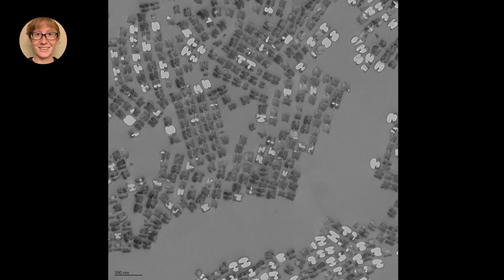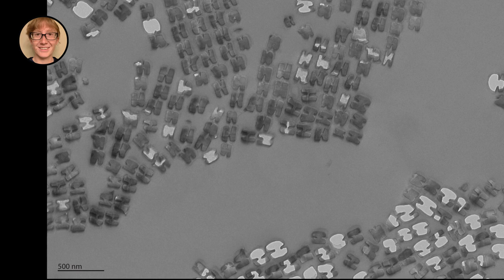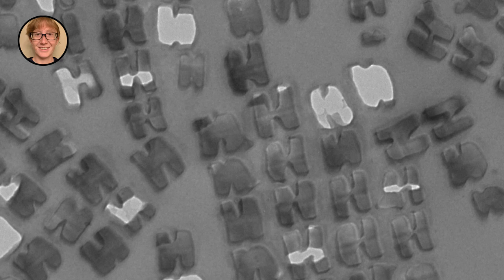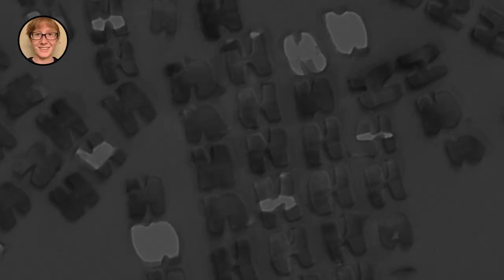Electron microscopy reveals the hidden inner world all around us. We are able to see objects that are smaller than the characteristic length of visible light and can therefore see the tiniest dimensions of plants and animals. In this image, we are not looking at some sort of secret code, but rather at Raphide crystals growing in the leaves of a plant called Alocasia.